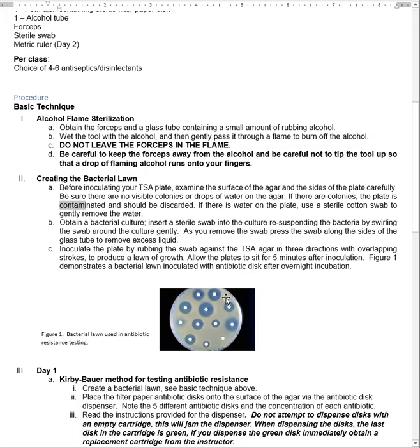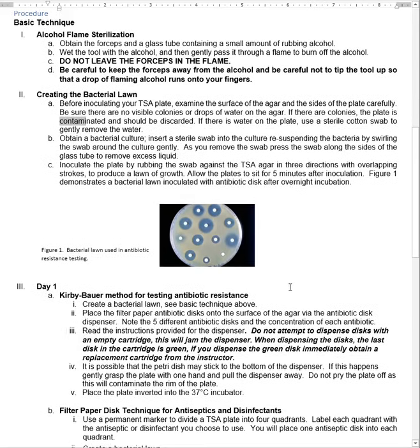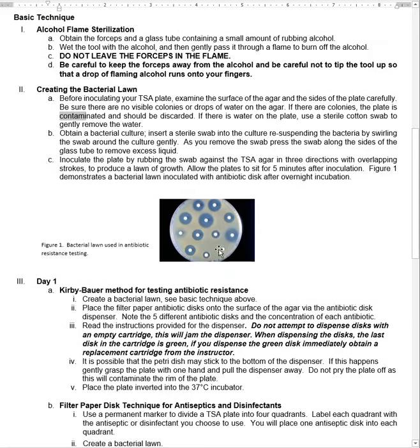And then we're going to put these paper discs on there, the ones with the antibiotics. The ones we actually use only have about 5, so they're kind of equally spaced around the rim. But there's nothing wrong with that. And you can see this antibiotic right there, the bacteria is totally resistant. It's growing up to and under it.